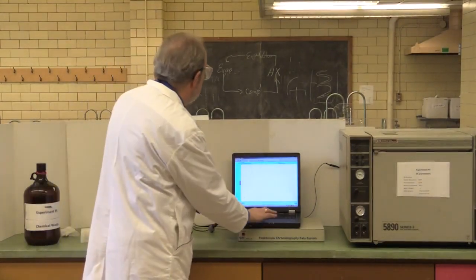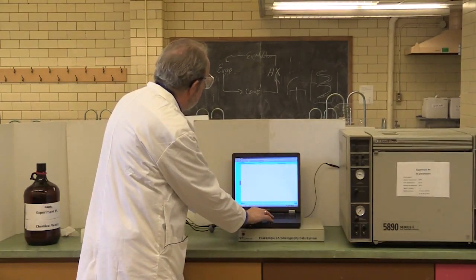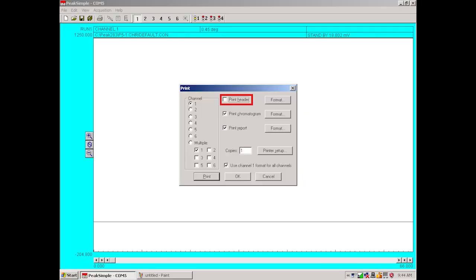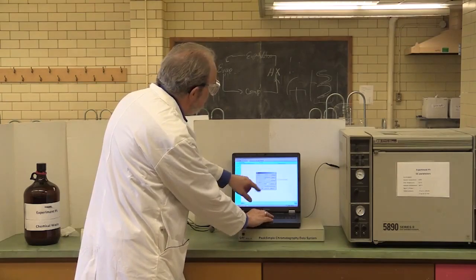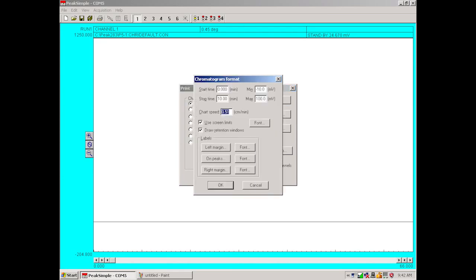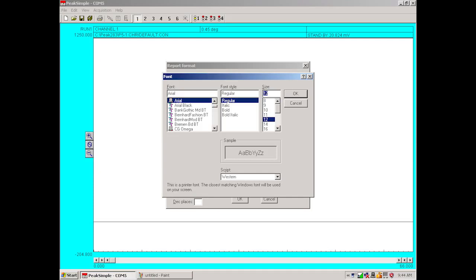We now have to reset the printing defaults. There is a print icon in the top row and you click on that and you get a pop-up menu. There are a few things you need to do at this point. There are three check boxes. Uncheck the print header. The next thing you do is go to print chromatograph and click on the format button next to it. Here we have chart speed. That is set at half a centimeter a minute. You want to set that to five centimeters a minute. And then there are other things that have font buttons. Click on every font button you see. The first one is for overall. And click on ten point. Otherwise, it will come out at three point and everything will be hard to see.